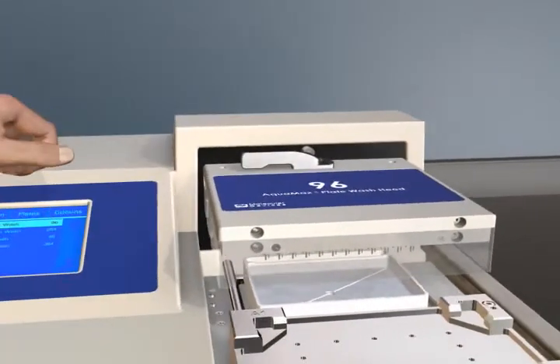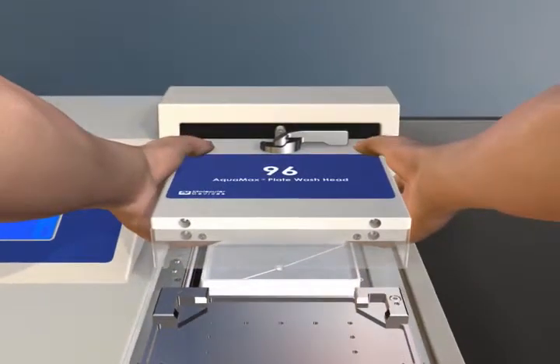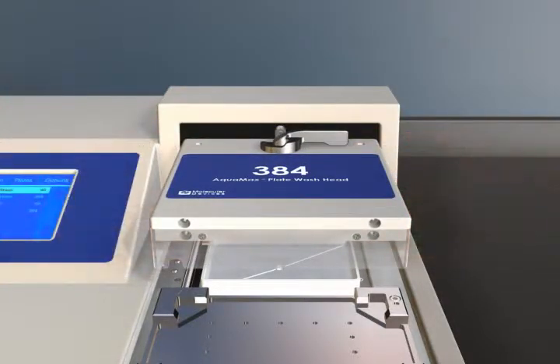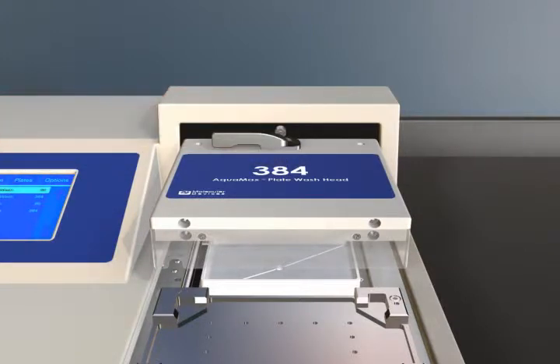No tools, alignment, or calibration is required for replacement and/or installation of the heads. 96 or 384 heads can be attached with a simple lever mechanism, providing an easy upgrade path from 96 to 384 formats.